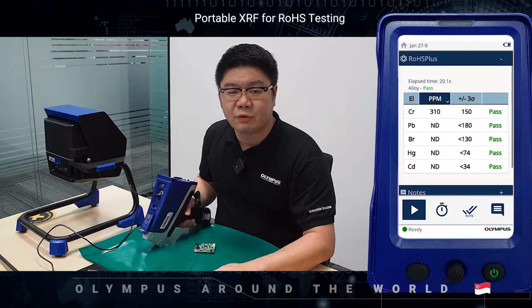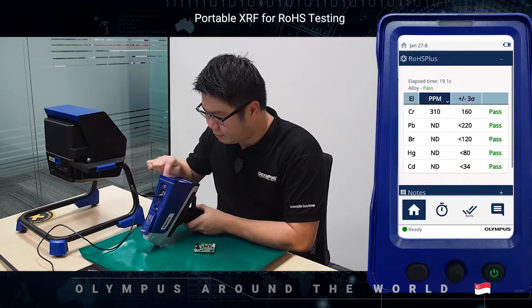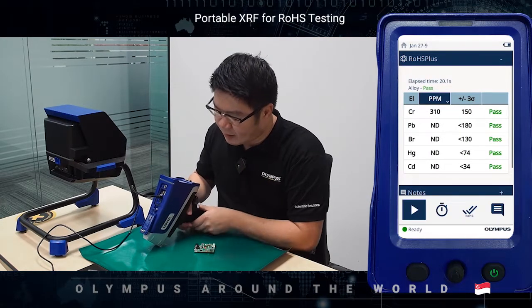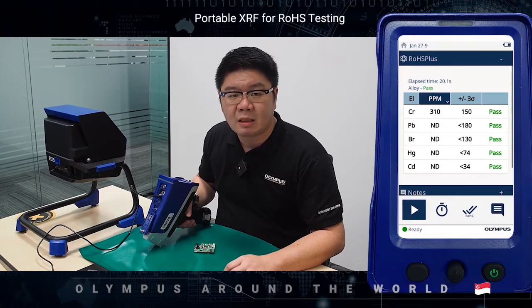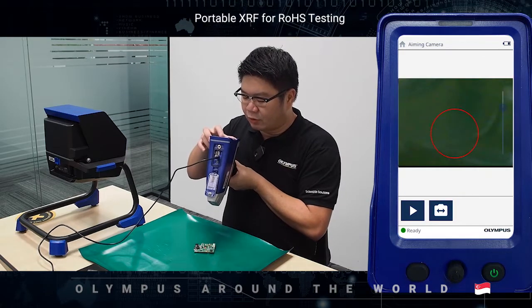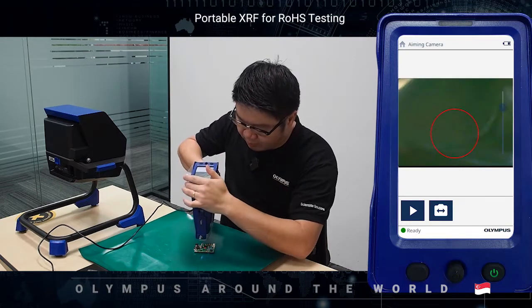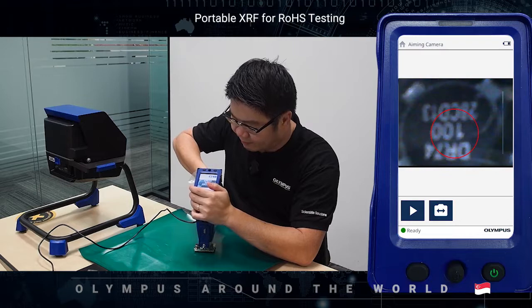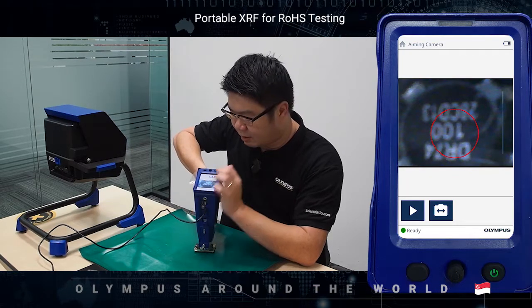Let me now show you how to operate the Vanta. The user interface is simple like a smartphone — all you need to do is swipe, flick and tap, and anyone will be able to master the operation in a short time. To start the analysis, first you can use our external camera to take a photo of the entire sample, then switch to the aiming camera to target a specific spot on the sample. To initiate a test, simply tap the play button or squeeze the trigger.